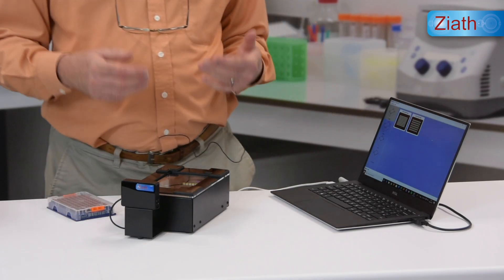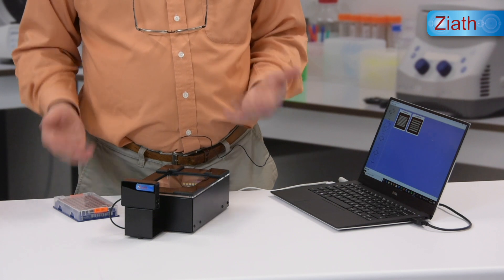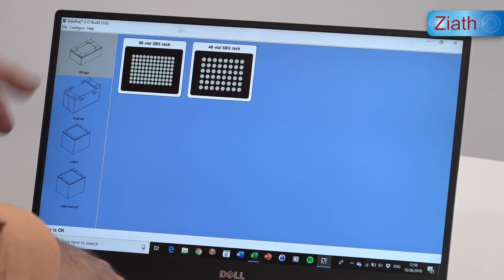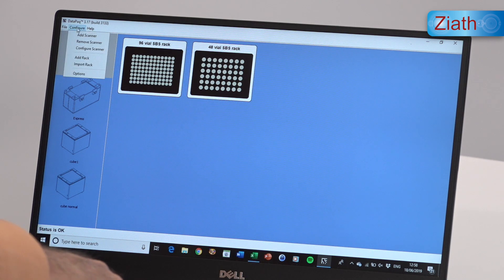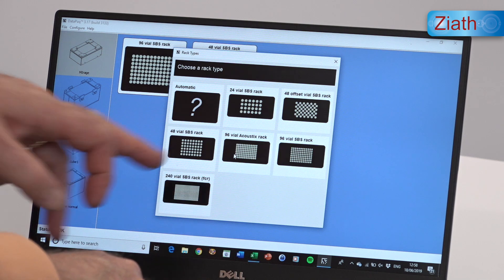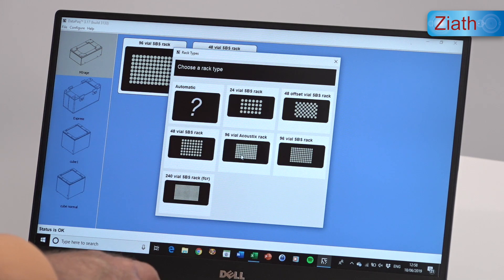Simply select in the new version of the software the acoustics rack, and we can do that very simply by going to the Configure menu, selecting Add Rack, and then down here the 96-vial acoustics rack.